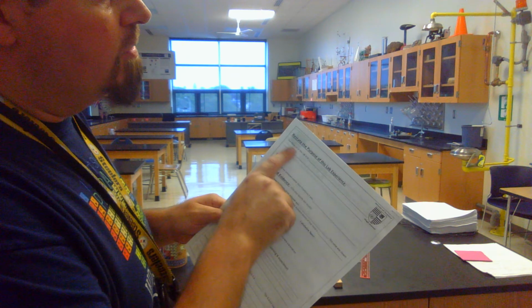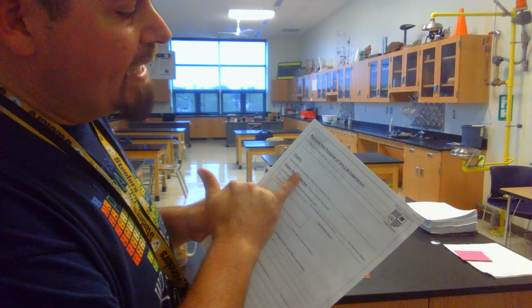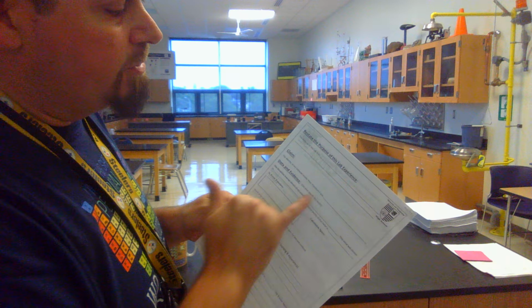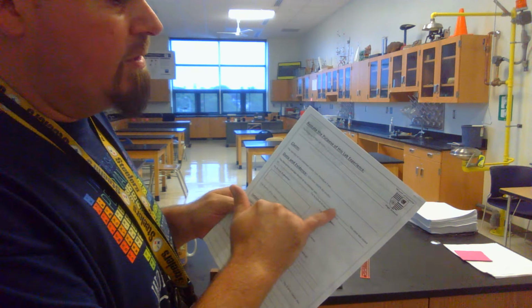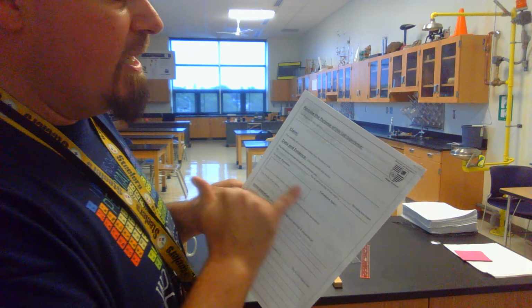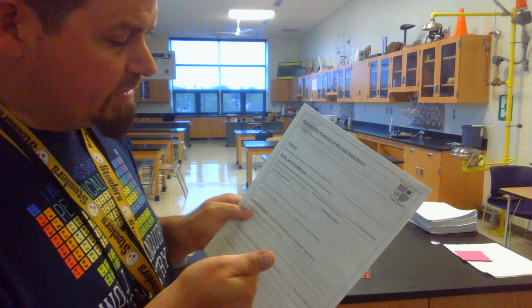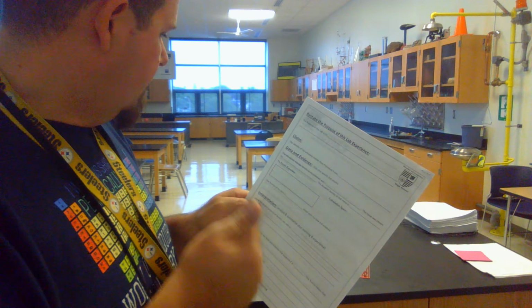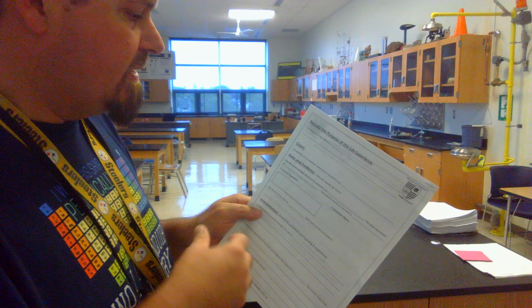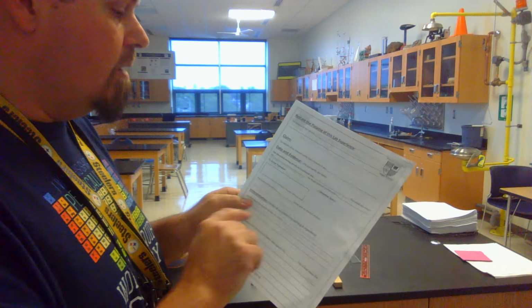So purpose, restate the purpose. We already talked about that. Claim, identify the unknown matter from procedure 3. My metal was, boom, make a claim. Your evidence, state what your average density was, the value closest, and then you have a calculation space to do your percent error based on what you measured the density to be, and then what the density is that you picked for the metal. Are you a little high, are you a little low, calculate your percent error.